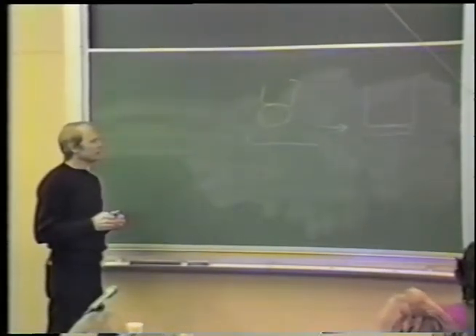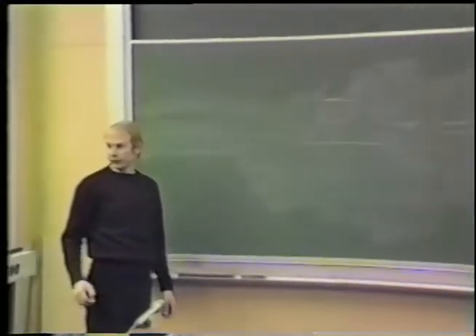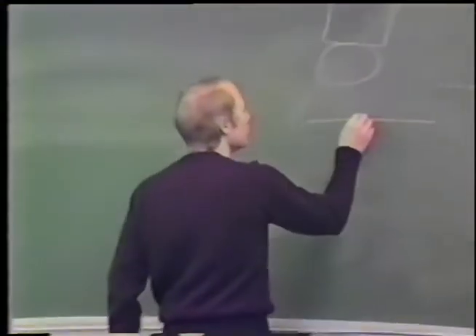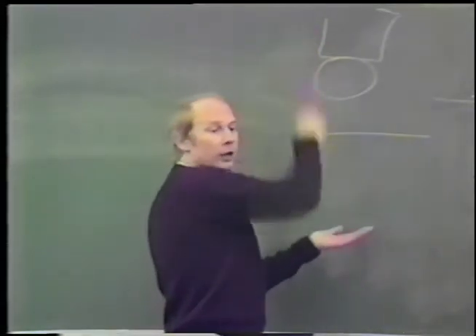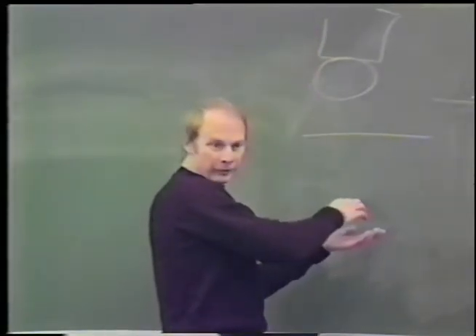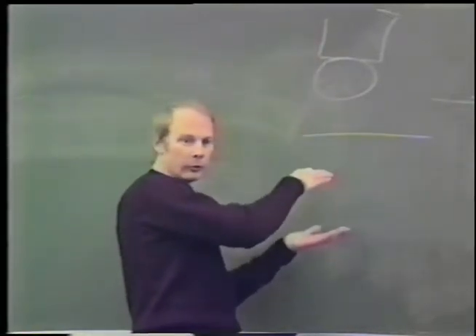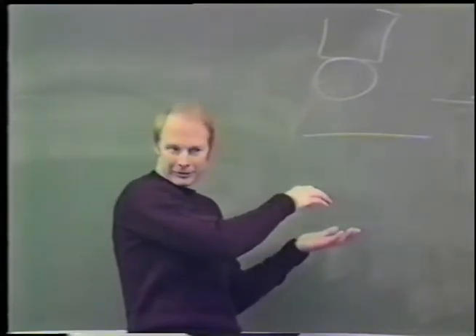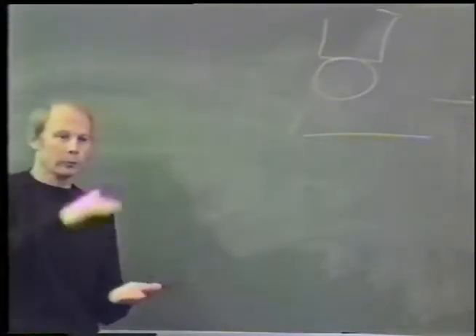Starting in 1964, Van Harreveld and co-workers decided to refine the cold metal block freezing technique, and they developed an apparatus which brought the sample into contact with the metal block without crushing it. They brought it into contact and held it there. When you have some mechanism for stopping the movement of whatever is holding the sample before it gets crushed, you have to make sure that the sample doesn't rebound from the block. Because in that case, you slow the rate of freezing. It continually makes contact and then pulls away.